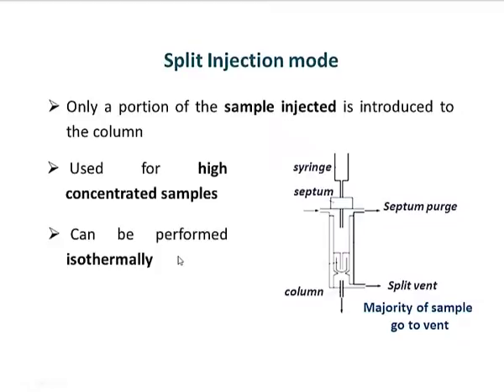The other thing is that with this injection, isothermal elution can be performed. It can be used for both isothermal and gradient, and I will explain them later. The next one is about splitless injection mode.